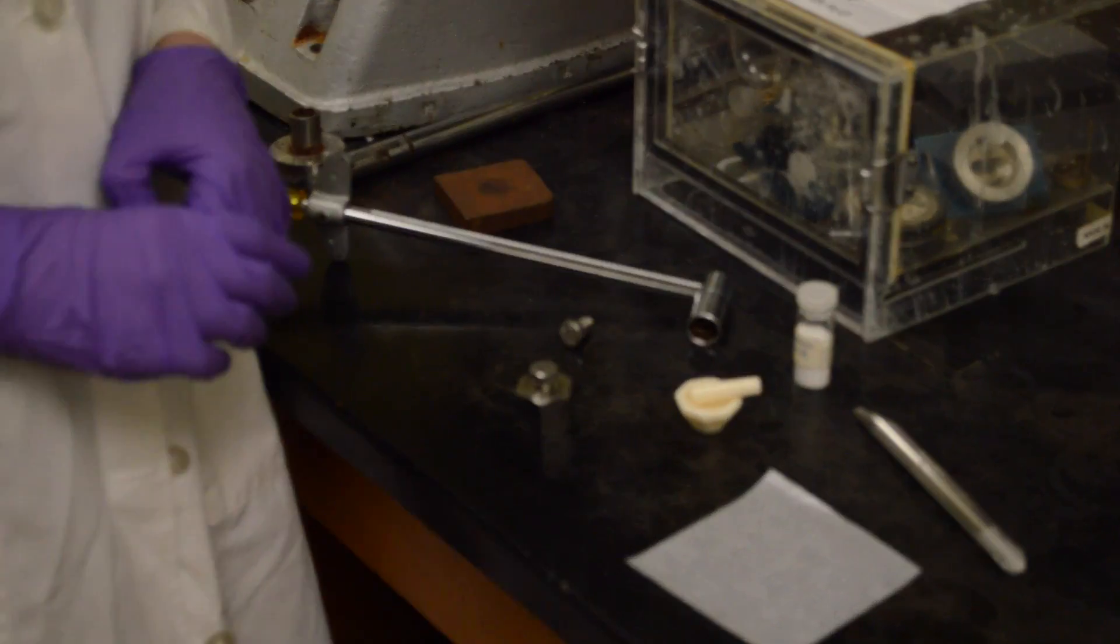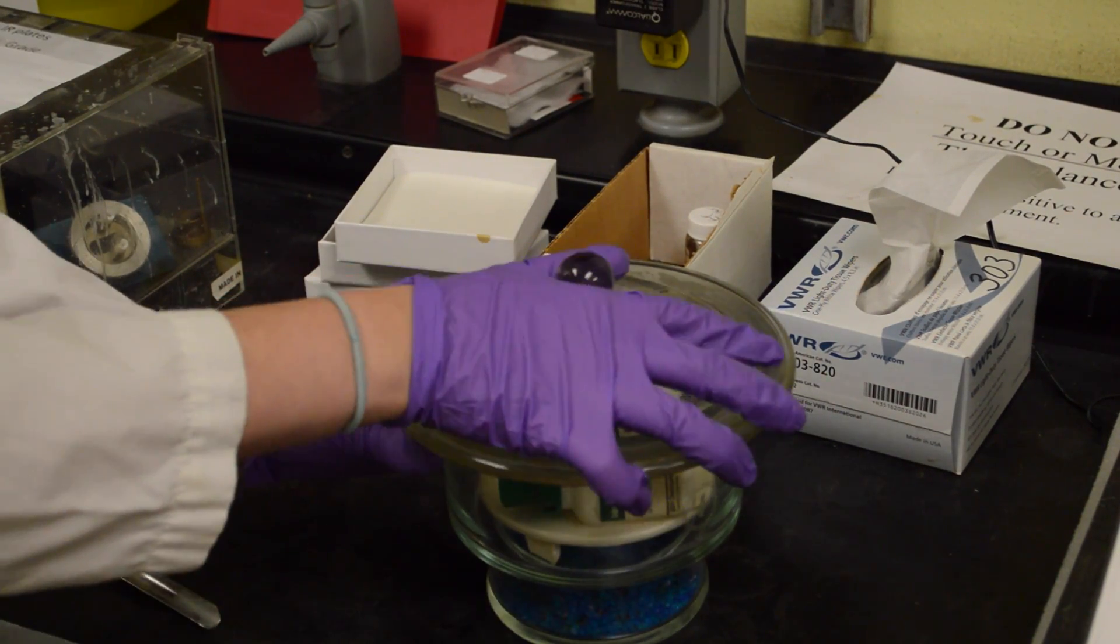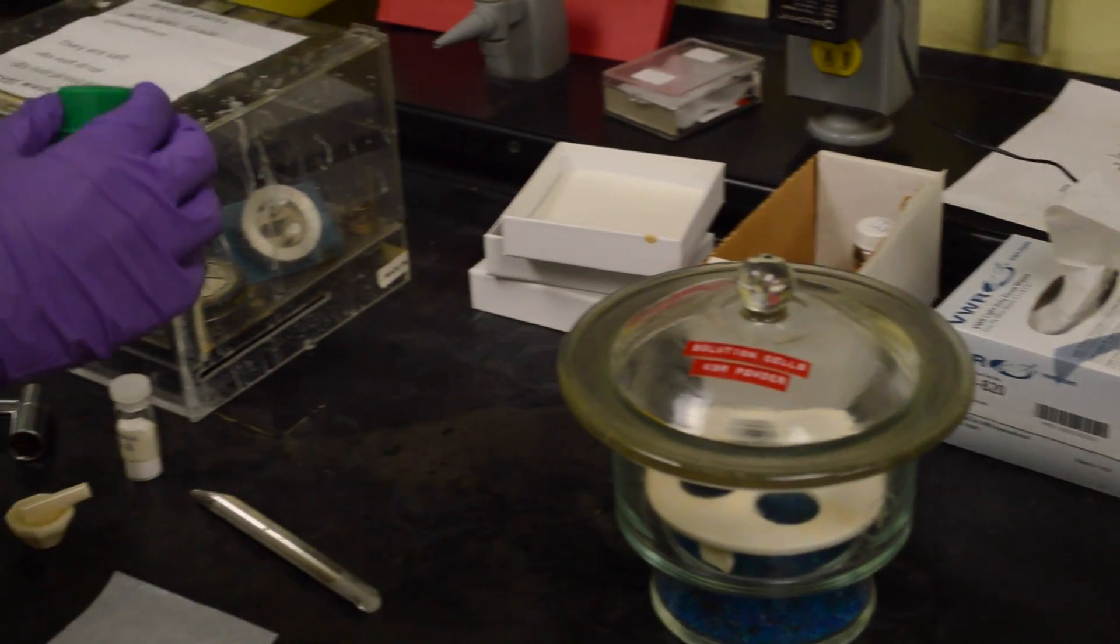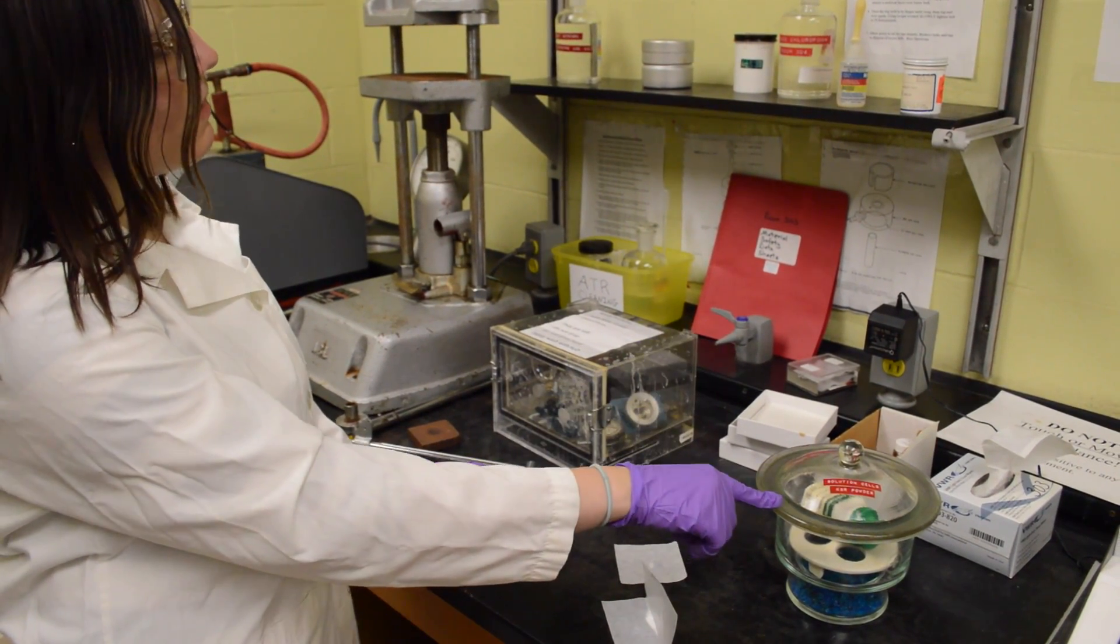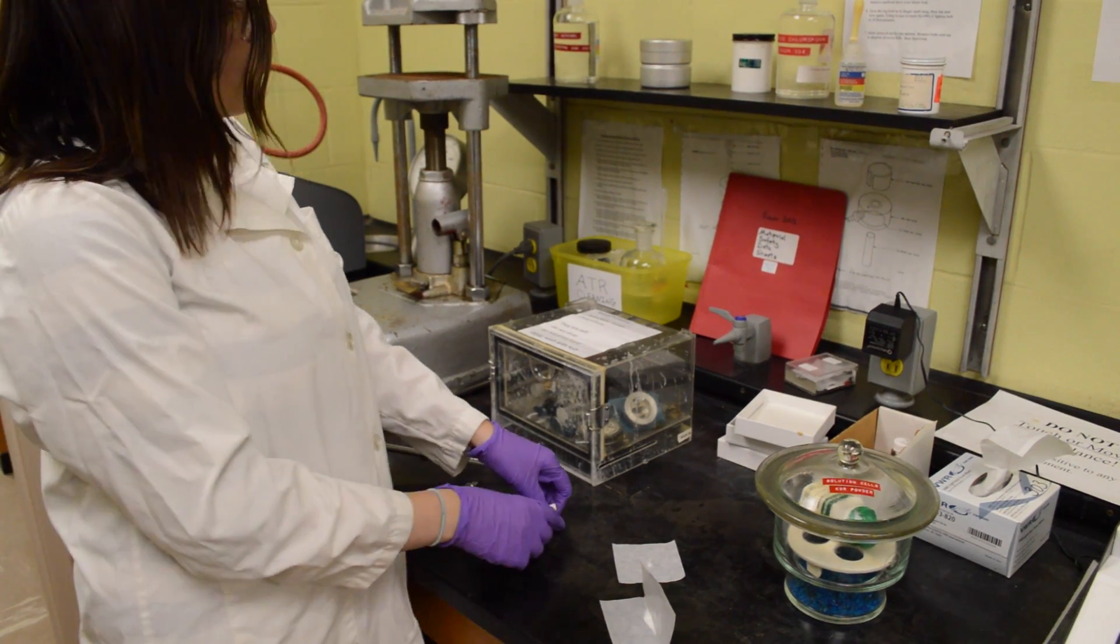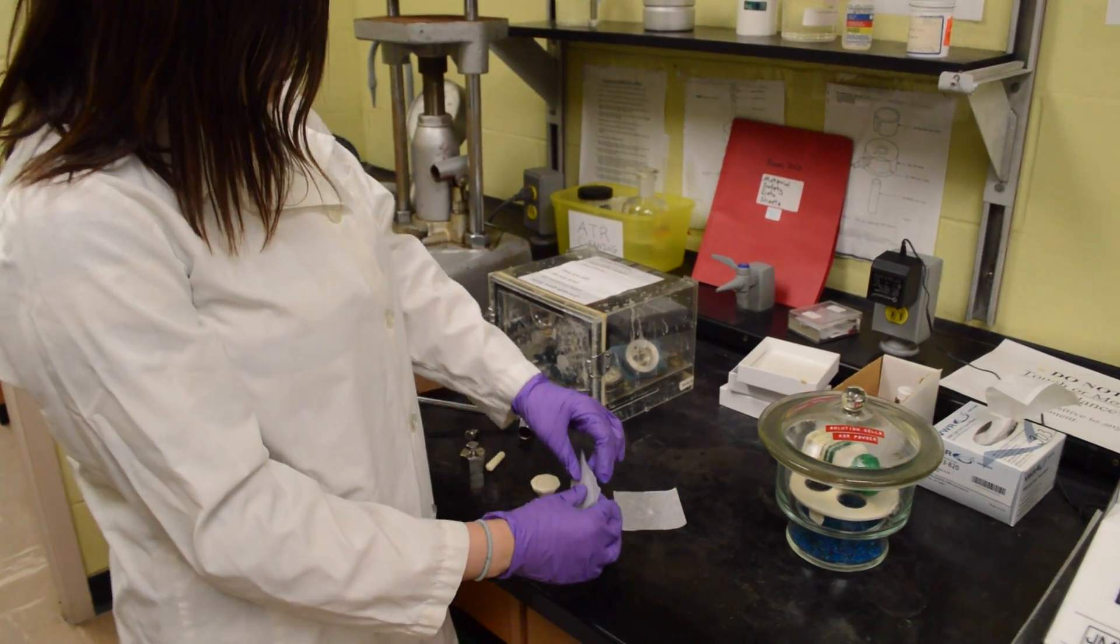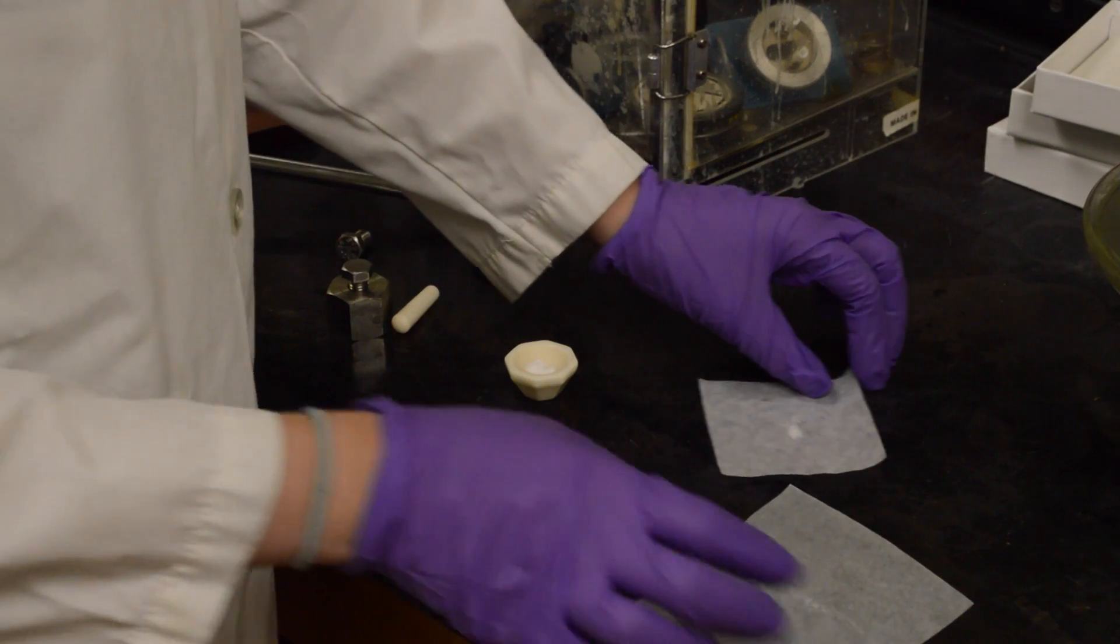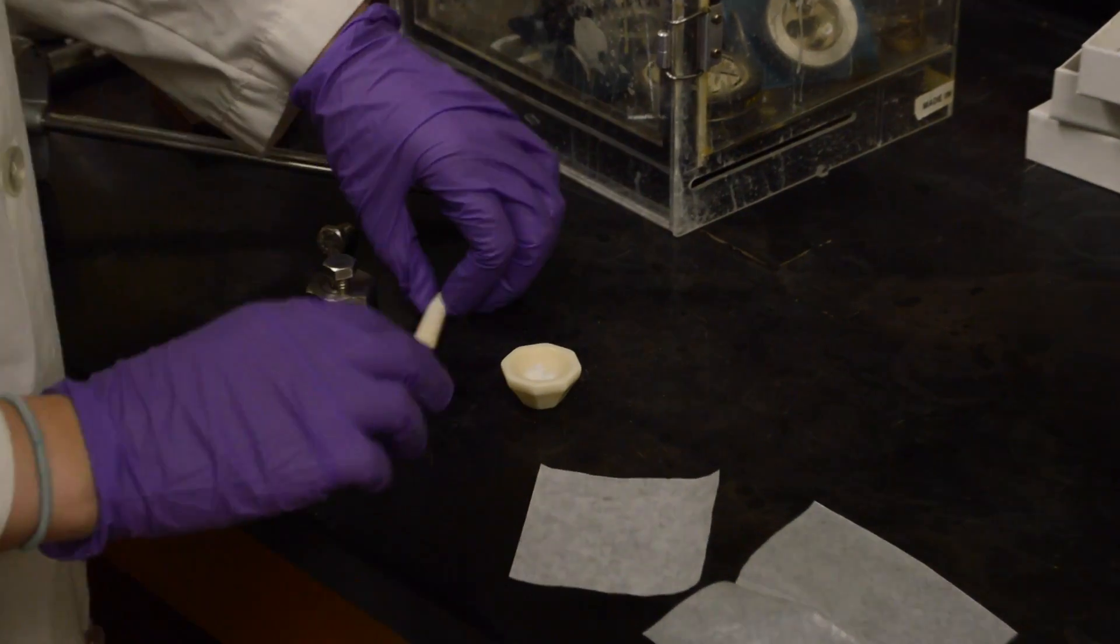Then you need to weigh out your KBR for analysis. You can get the anhydrous KBR powder out of this little holder and go to the analytical balance. We weighed out 200 milligrams of the KBR powder, as well as 2 milligrams of our sample to be analyzed. Using the mortar and pestle, we want to mix those together really well and grind them up. I'll just pour them in here, and then we grind them together.